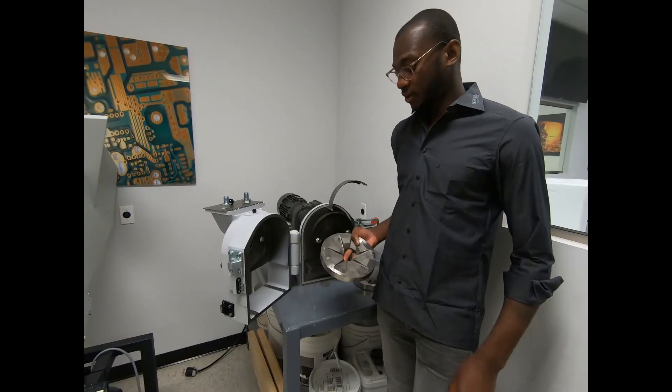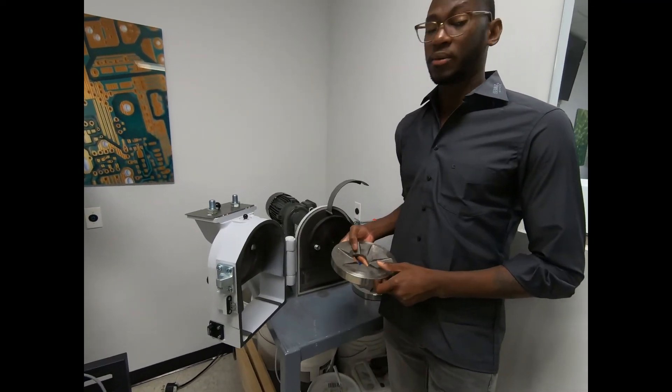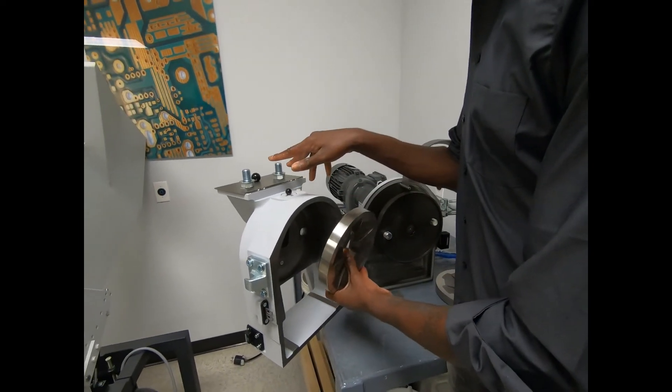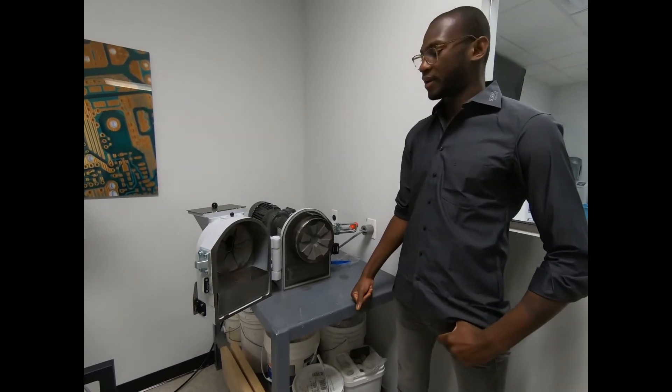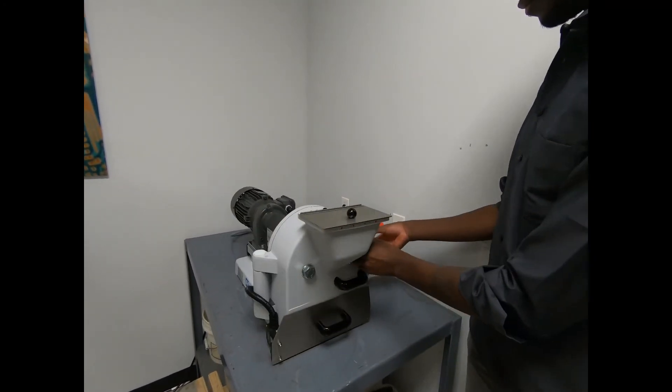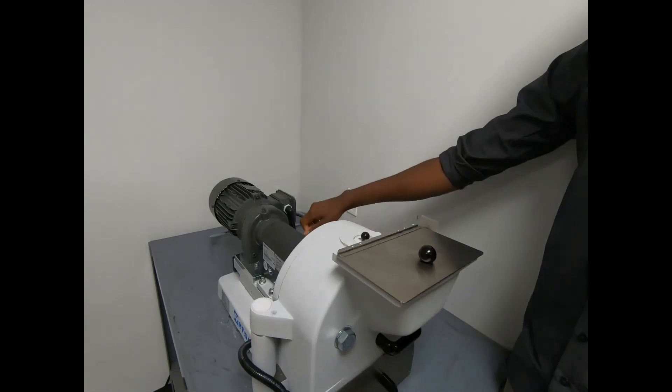Next you're going to want to install the grinding disk. You're going to start with installing the grinding disk for the door, which are held in place by these two bolts. Now that you have both grinding disks installed, you can go ahead and close the unit, turn it on, and begin operation.